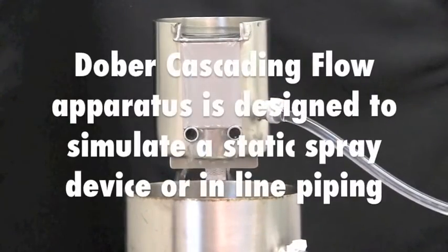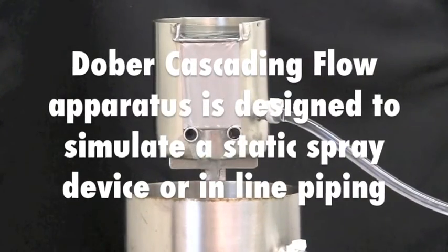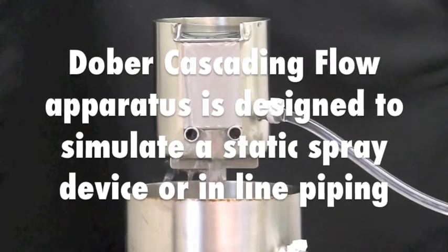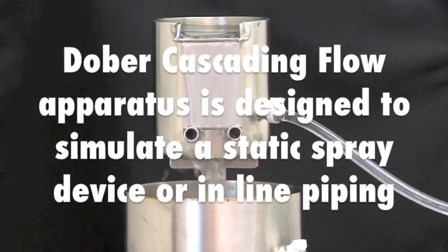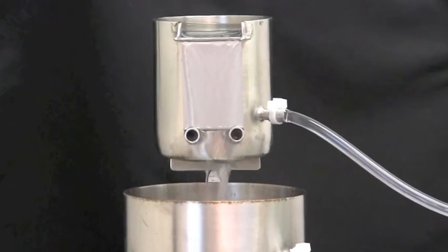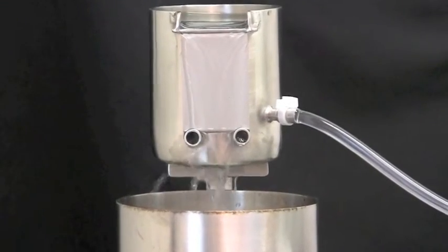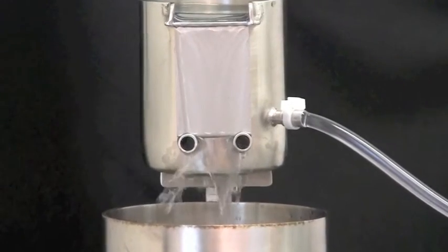The Dober cascading flow apparatus is designed to simulate the gentle flow of cleaning fluids across the surface, such as might be encountered with a static spray device or through in-line piping. Here again, the soil application is critical to the development of valid TACT parameters.